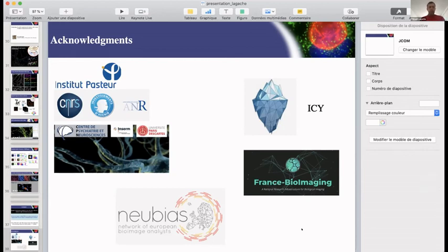So you have to specify some parameters of the DBSCAN to segment the clusters, because SODA is going to look inside the clusters and look at the single localizations inside the segmented clusters. The approach is completely different from the other approaches in localization microscopy, where more or less you look at how the clusters interact, overlap or correlate. Here you segment the cluster and directly look inside at the molecular level, at the single molecule level.